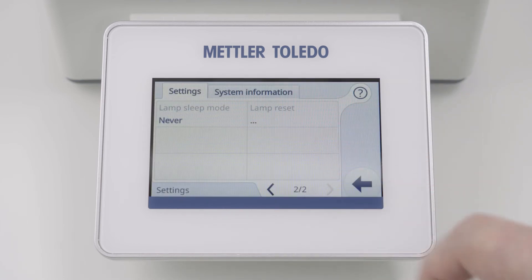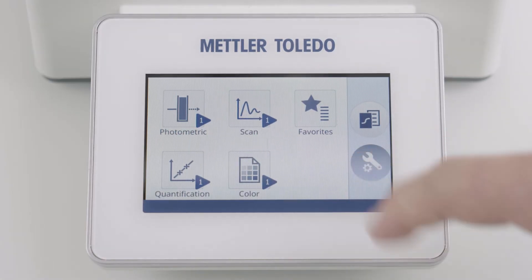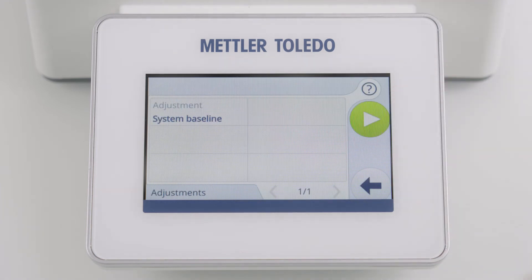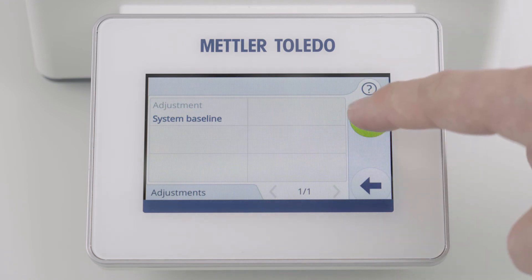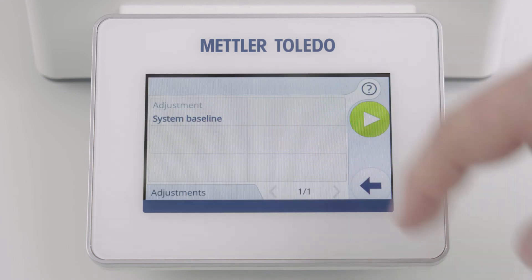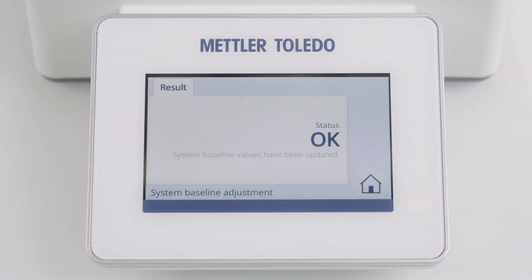After a warm-up time of at least one hour, you have to perform an adjustment. Go to Setup and Tools, Adjustments and select System Baseline. Press the Start button and confirm that the compartment is empty. Now your instrument is again ready to use.